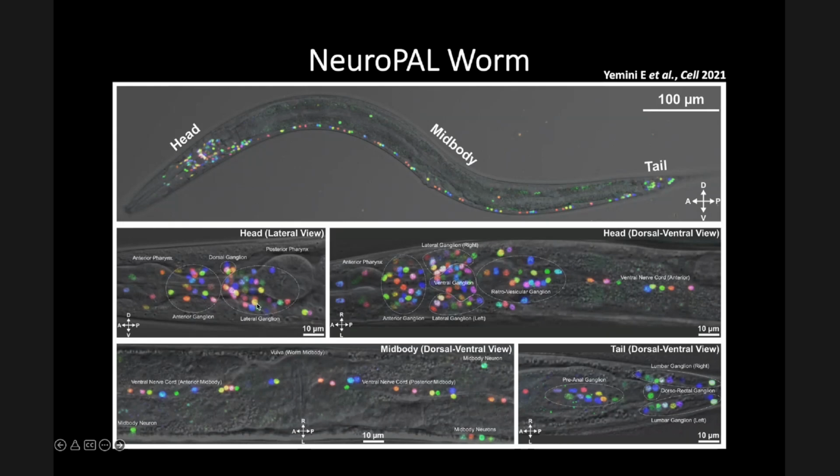Well, these are neurons of the same type. This is a DB neuron here. No, sorry, this is a lateral ganglion. So this is, in fact, a neuron in a different ganglion here that's kind of sneaking through. But generally speaking here, the neurons are distinguishable from their neighbors. So in this example, there's 2 blue neurons, and these are 2 VD type neurons. That really doesn't matter. I'm getting into too much detail.